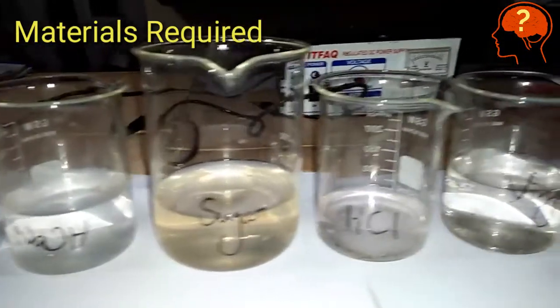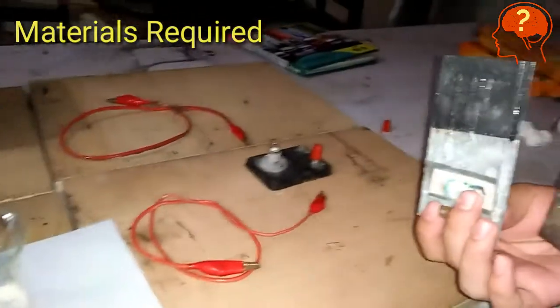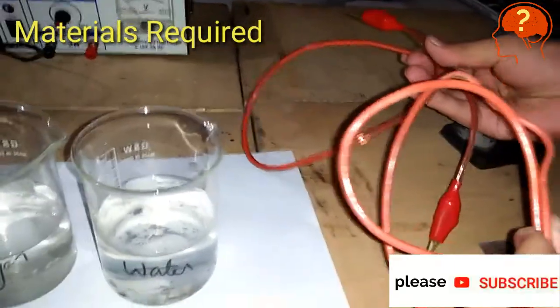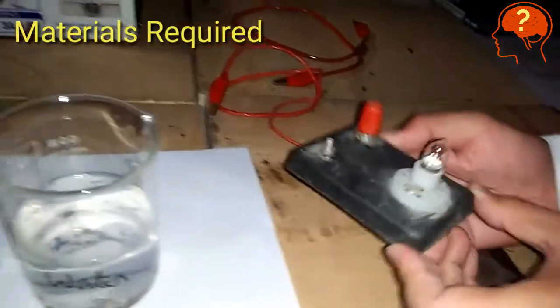We will check the conductivity of different solutions like salt, sodium hydroxide, sugar, HCl, vinegar, and water. You need two electrodes — a copper electrode and a zinc electrode — and two colored connecting wires. These are two red color connecting wires and a bulb which should have two terminals, as you can see here.